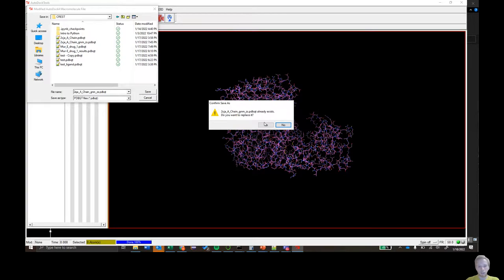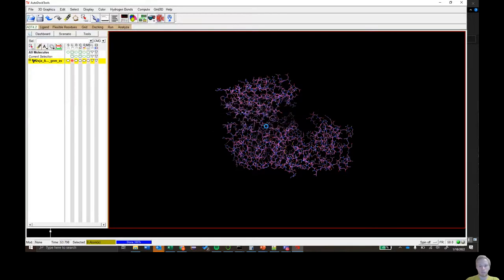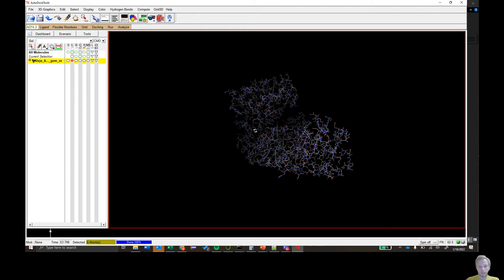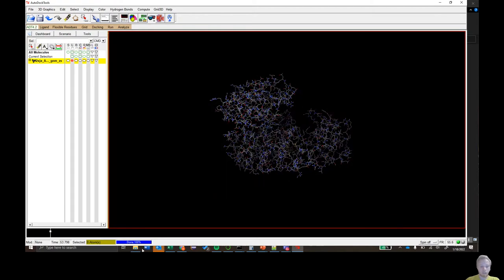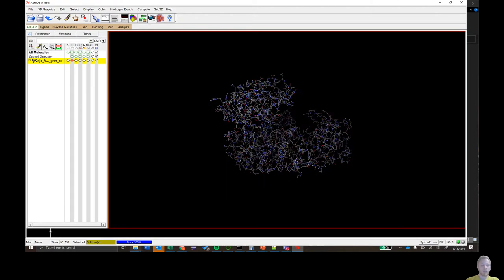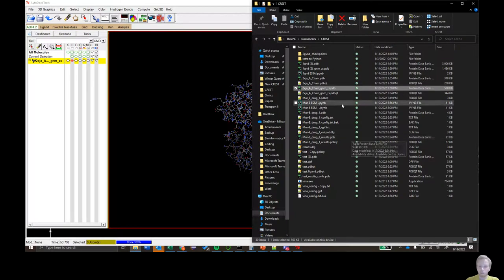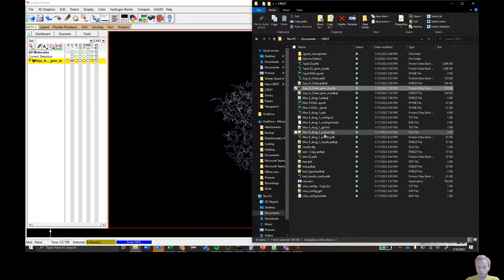I've done this before so I'll overwrite it. You should see it turn a different color indicating the program has taken it in. The next thing we need to do is put in our ligand, which in this case will be my Mur-E drug 1 results.